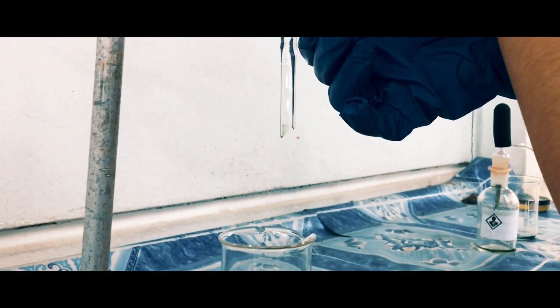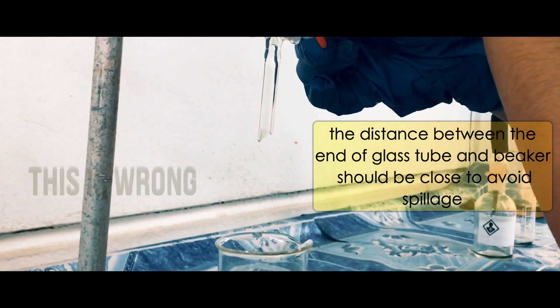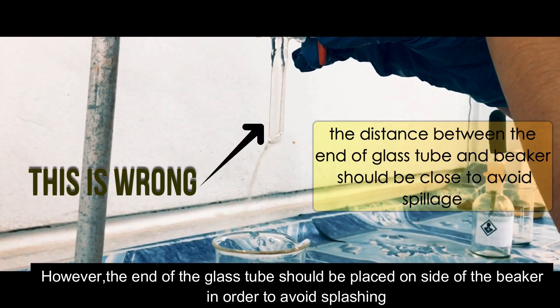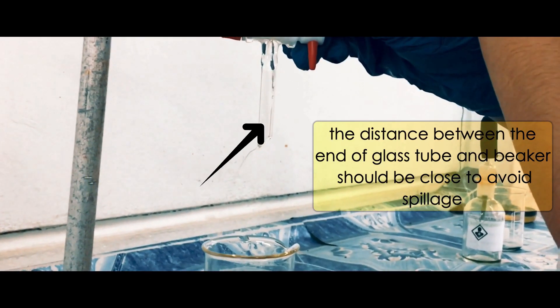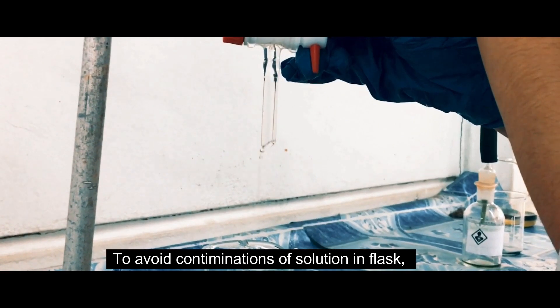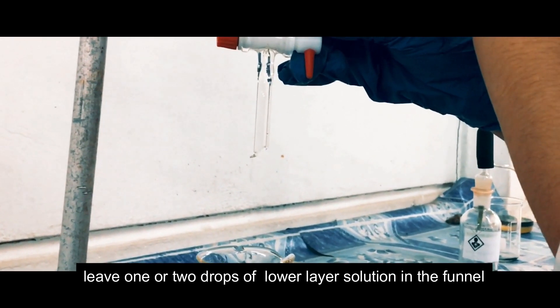Slowly open the stopcock to transfer the lower layer into beaker. However, the end of glass tube should be placed on side of beaker in order to avoid splashing. To avoid contamination of solution in funnel, leave one or two drops of lower layer in funnel.